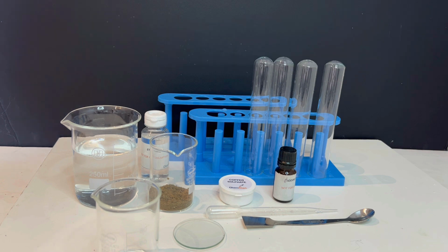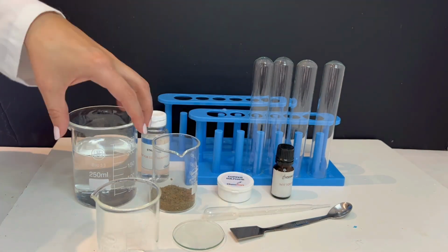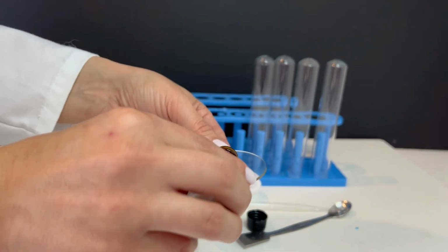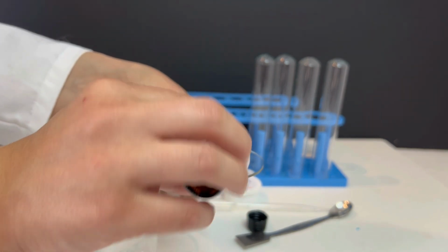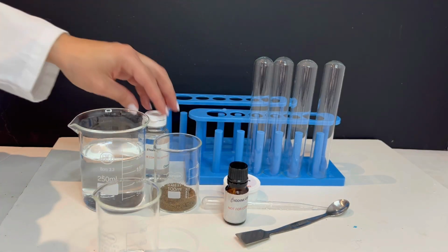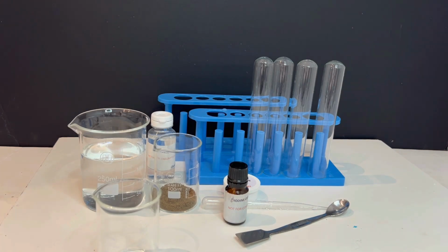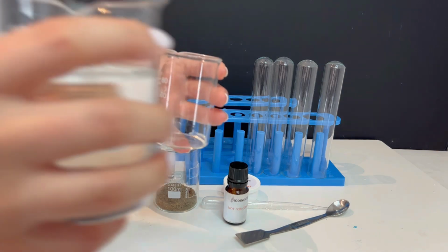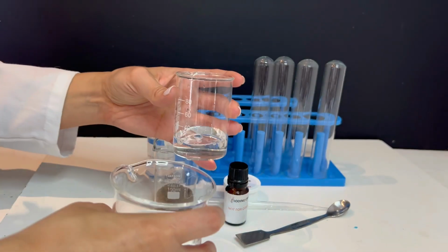For this experiment, we will need the following apparatus and reagents: 4 test tubes, a test tube rack, a spatula, a pipette, water, sand, copper sulphate, iodine crystals, and ethanol. Now let's begin by preparing the mixtures in the test tubes. First, we are adding about 20 milliliters of water and a spatula of sand to the first test tube.